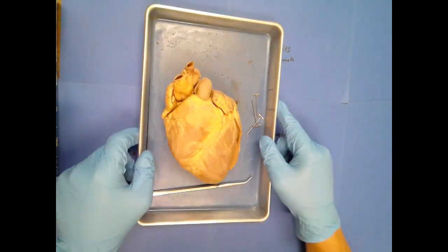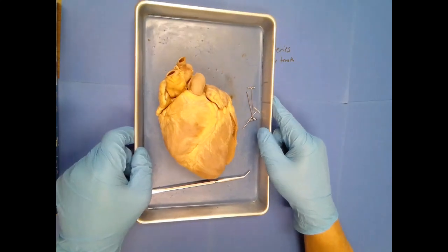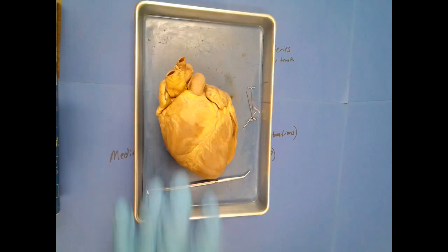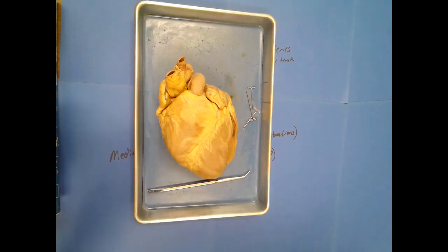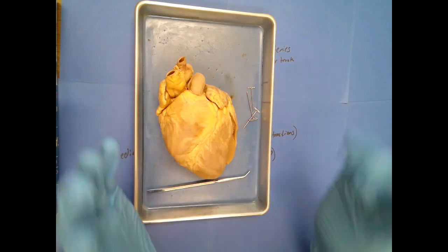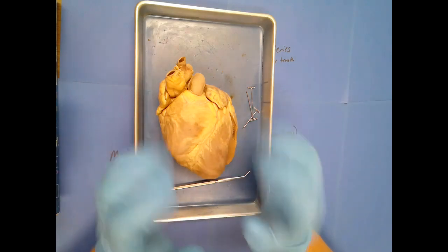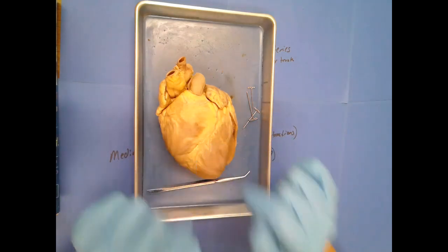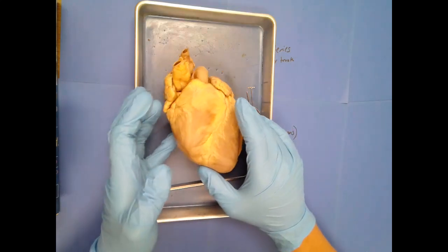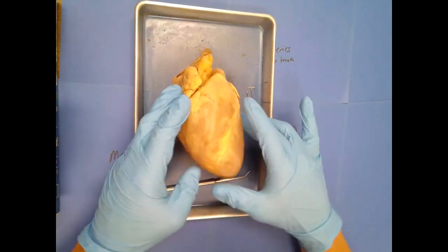So this here is a large pig heart. I'm borrowing this heart from a colleague. The hearts I normally use are sheep hearts because they're closer to human size, but the reason I want this heart is that much of the exterior was left intact. So this is an anterior view.